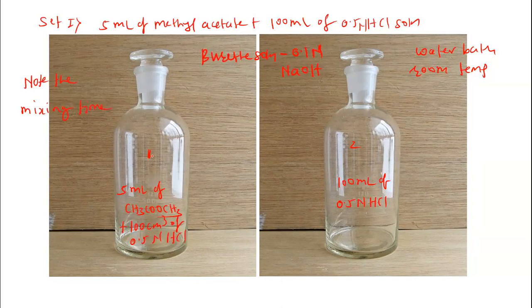Immediately we have to withdraw 5 ml of the reaction mixture in a conical flask.